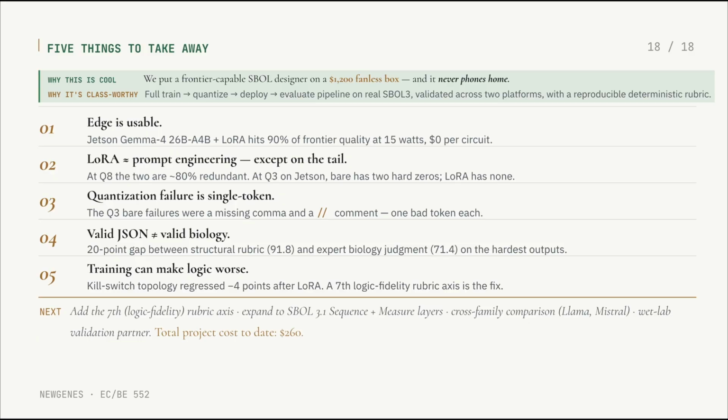After running against the 100-prompt rubric, both models perform fairly well. The Jetson hits an average of 89.6, while the MacBook hits an average of 92.2. Both devices show concrete results, demonstrating the feasibility of the workflow of using a large language model to generate SBOL3 outputs.